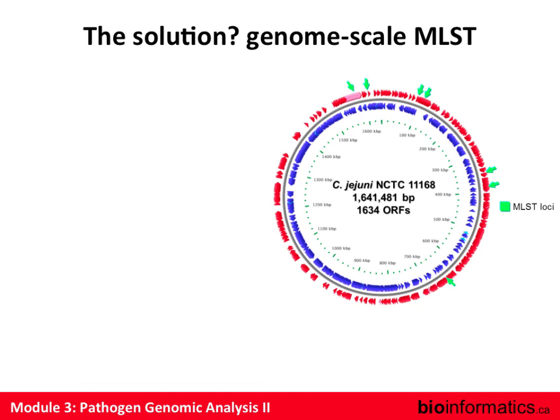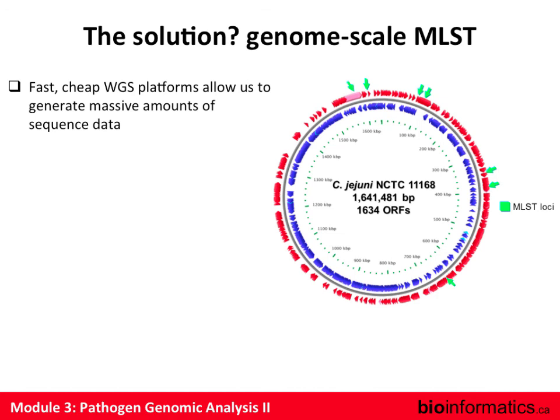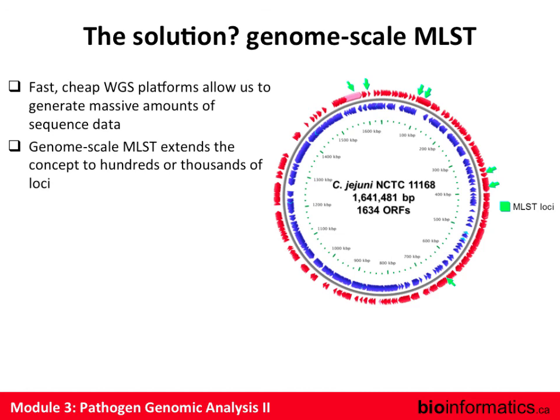So the solution, of course, is genomics. We can sequence a lot of stuff really fast. And basically, all it is, is extending the concept to a whole genome, right?